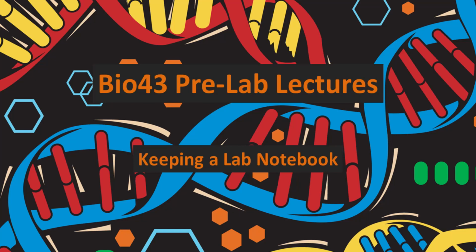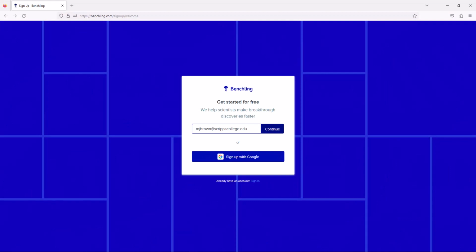This will be about keeping a lab notebook. We'll be keeping electronic notebooks using Benchling. Setting up a Benchling account is quick and easy.